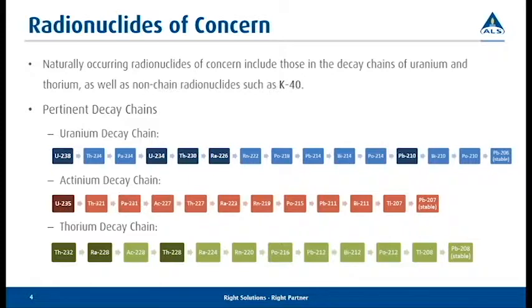So what were the examples, Kelly? Sure. The daughter products were, for example, TH228, TH230, RA226, PB210, and the parent products were examples TH232, U238. And stuff. So on most of those, we're going to do it through our gamma, where we're going to be looking at a number of the smaller daughter products. And I didn't write them down, so there's a lot of numbers there, and I can't remember all the isotopes you had listed. So there were a lot. Carl, if you did want to follow up, feel free to raise your hand, and I can unmute you if you want to ask a direct question.